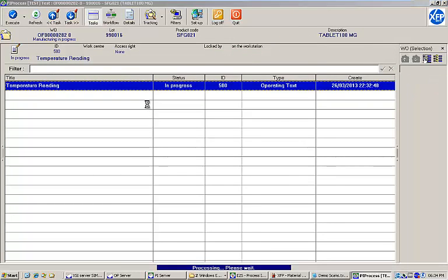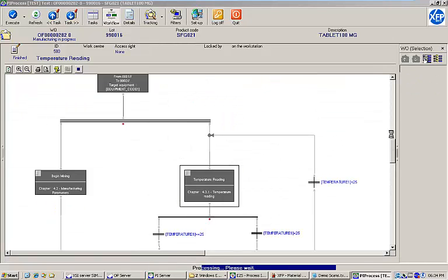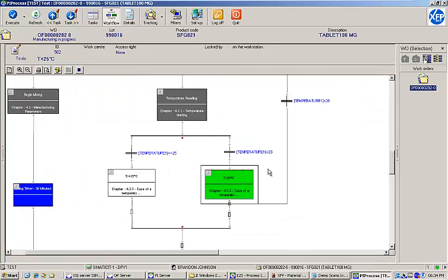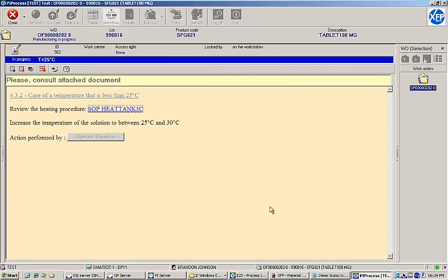Based on the temperature value that I recorded, the EBR execution has taken the right-hand path. This task instructs me to follow the heating procedure to increase the temperature of the solution to between 25 and 30 degrees Celsius. I'll review the procedure and provide a signature.